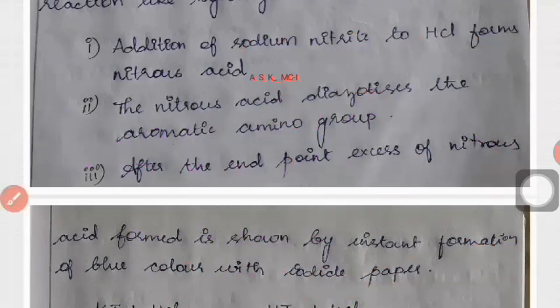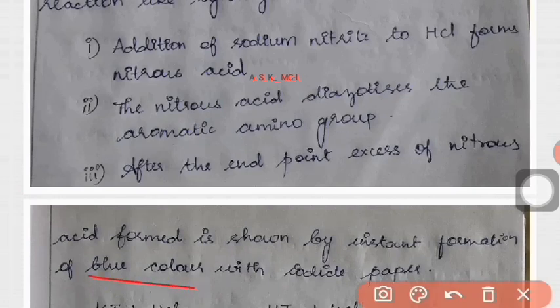Now you can understand how the end point is determined. Nitrous acid HNO2 reacts with potassium iodide to give iodine, which reacts with starch to give the famous blue color.